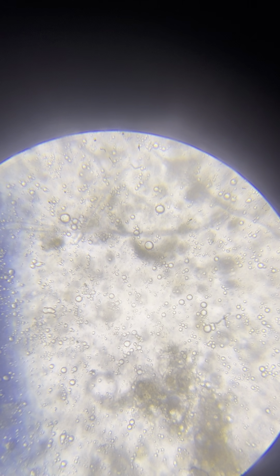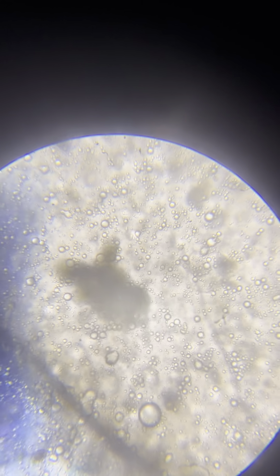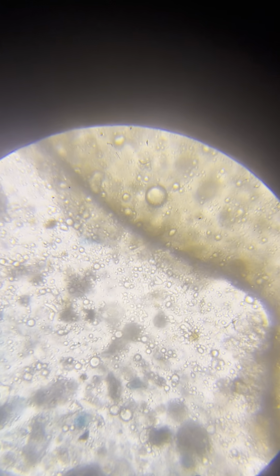So they can be created from beeswax, but we don't see them feeding. We don't see them with the yellow belly and the gold belly. When you have so many neros, it's always that a large part of them are feeding, like in a sample from an ecological container. You see millions of them here, and hundreds of thousands you see with the golden bellies and the yellow bellies. It's very prominent in this channel.